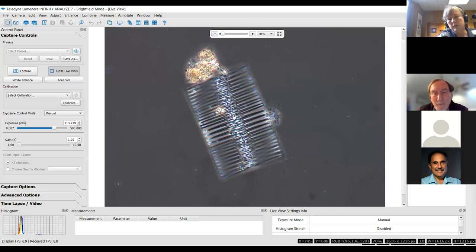And this is Fragilaria crotonensis, so ends don't touch. It's got that zipper down the center of the colony. It's one of the most recognizable diatoms, and a big filter clogger for water supplies.